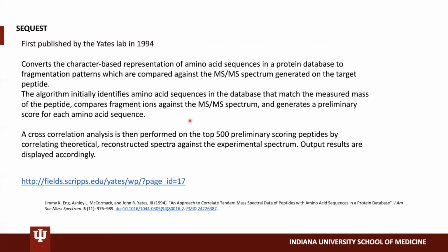If you think of it from that analogy, the MS data is like all the pieces of the puzzle that you put together to make the picture that's on the front of the puzzle box. So MS1 and MS2 work together to be able to solve that information of this sequence. And in addition, you get cross-correlation analysis and then outputs.